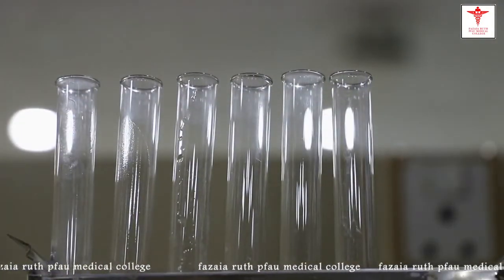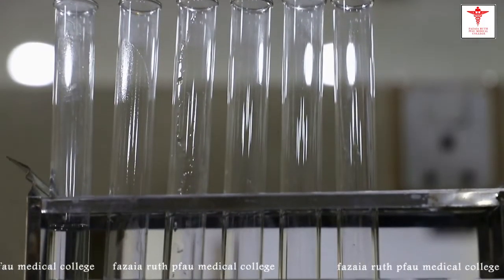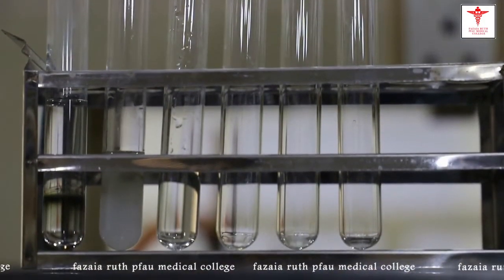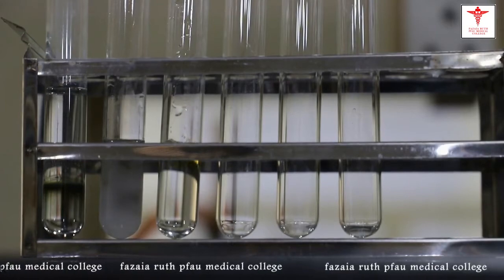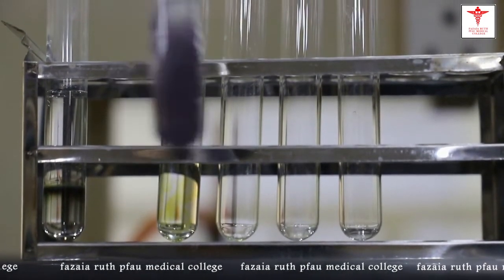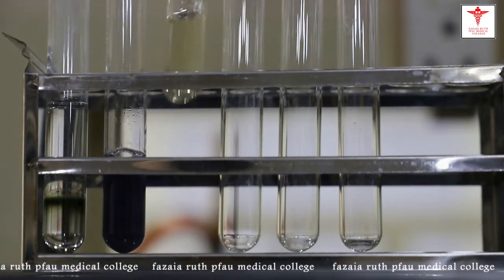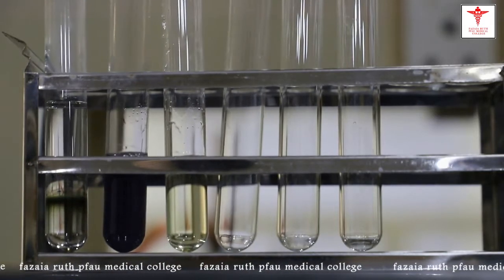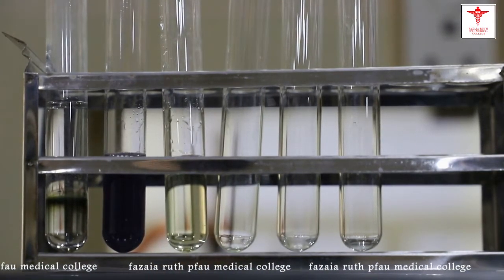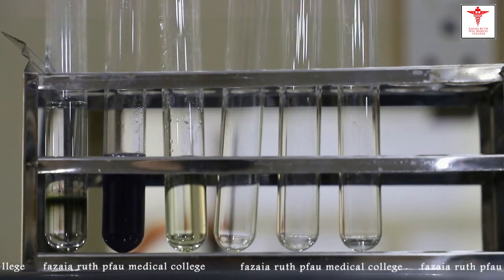Now we'll add the iodine solution. Only 2 drops are required. We'll shake the test tubes now. So you can see in the first test tube that we added the iodine, there's a color change, and this blue color is showing that the given sample contains a polysaccharide.